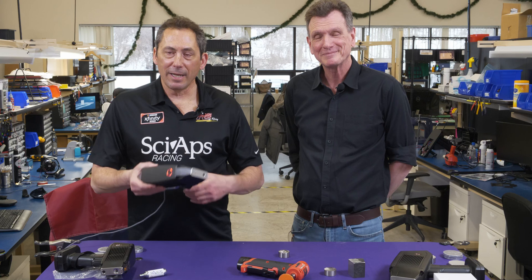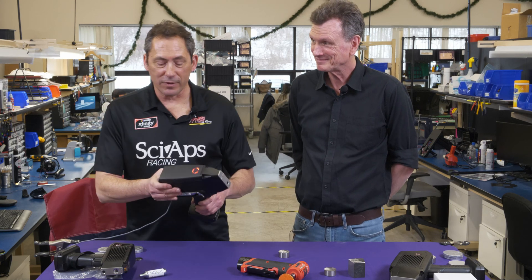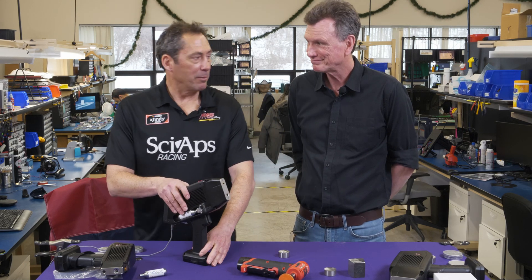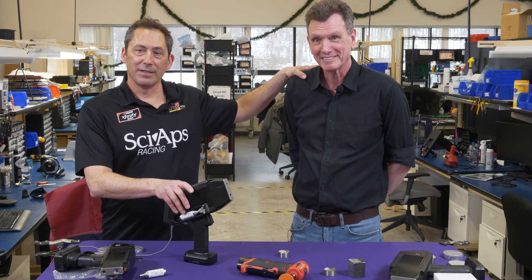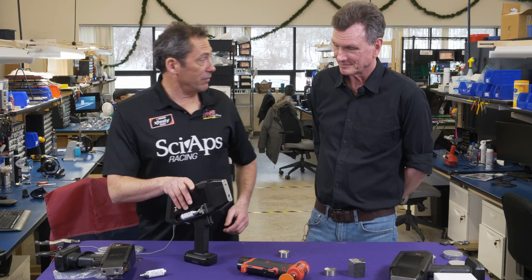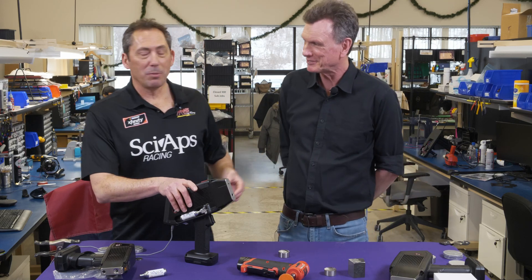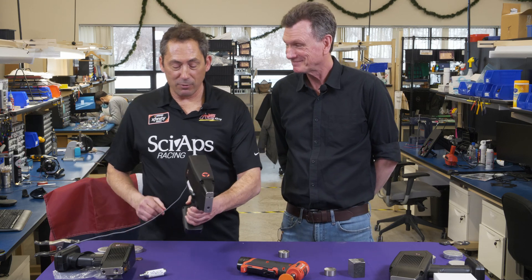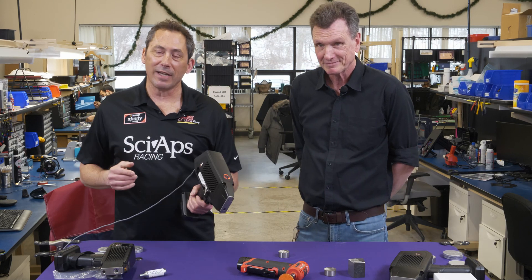Here we are back for another SciAps video. My name is Don Sackett, I am one of the founders of SciAps, and today is a great day for video making because my co-founder Dr. David Day has joined us. Dave is one of the inventors of this — the main inventor. So Dave's here and he's going to help us demo this great new CSi unit.